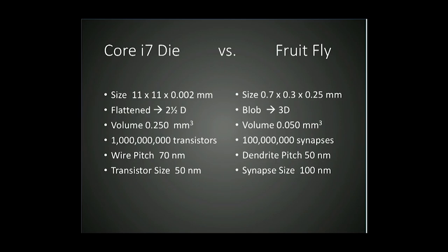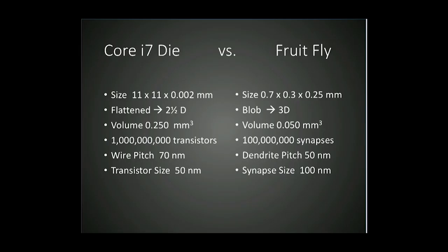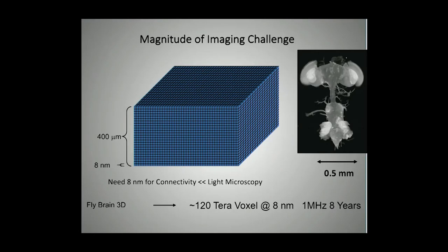The challenge is to bridge the gap between the small size of tens of nanometers all the way up to a good fraction of a millimeter and catch that large dynamic range. To reliably resolve these transistors in all three dimensions, we need to sample, probably instead of 50 nanometers, maybe at 5 or 10 nanometer increments. These are the voxels that you'd use to form images, and you've seen before, one can collect many such images in 3D to form a stack.